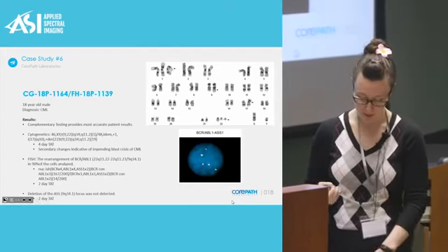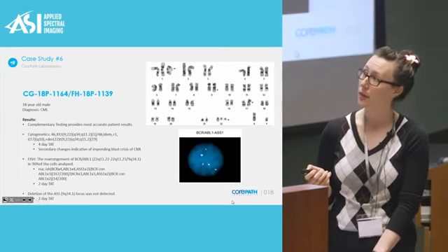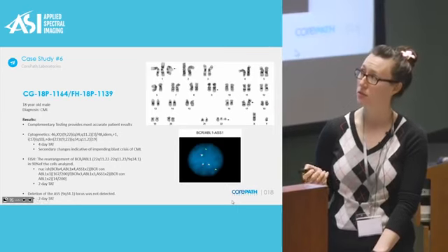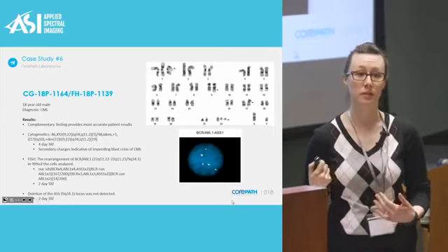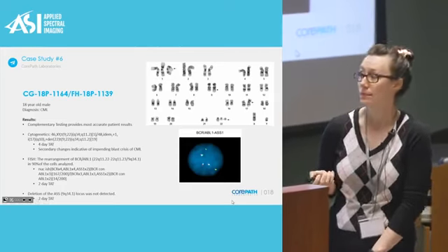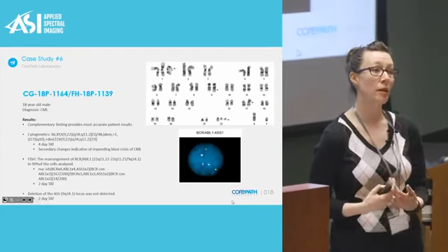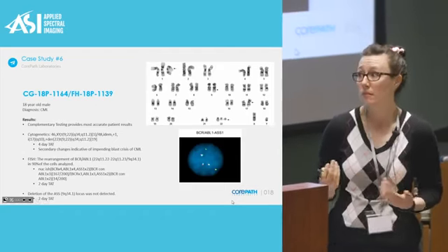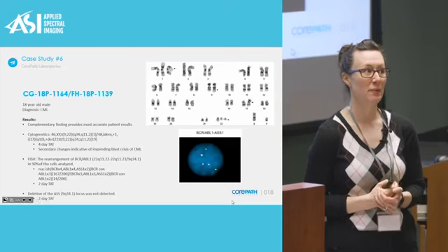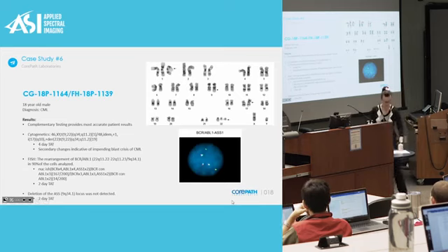Now, with these 2 testing types paired together, we were able to provide a clearer diagnosis for this patient. And the iso 17q paired along with these other results, especially the additional Philadelphia chromosome, is indicative of a secondary change. Now, these results are kind of important. You have a secondary change, and this is indicative of impending blast crisis. So we were able to provide someone with results that potentially change their life. They have an impending blast crisis that's going to affect their treatment plan and their outlook. So we were able to provide better stories for this patient's life.